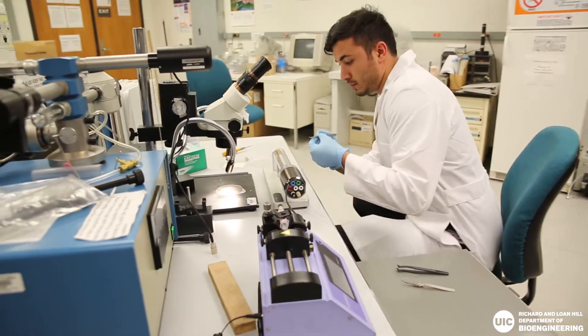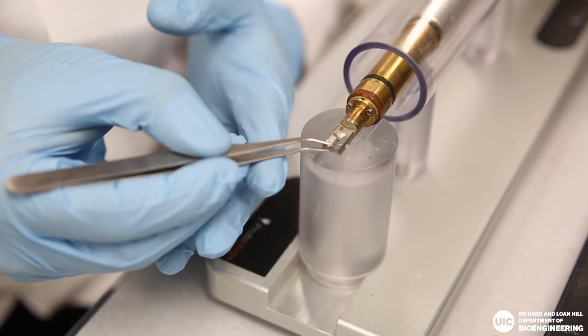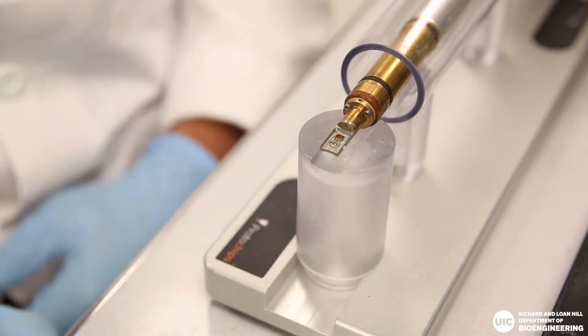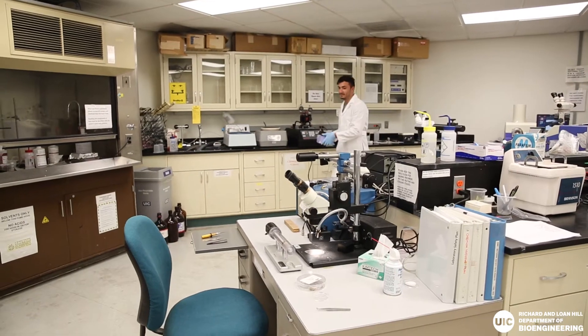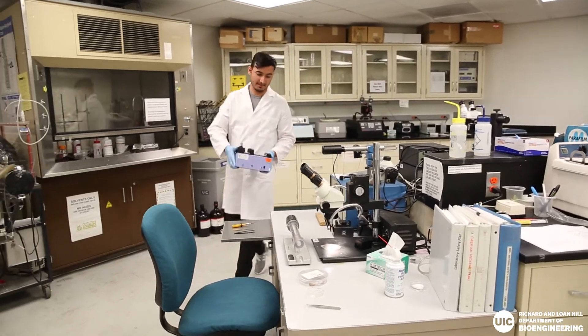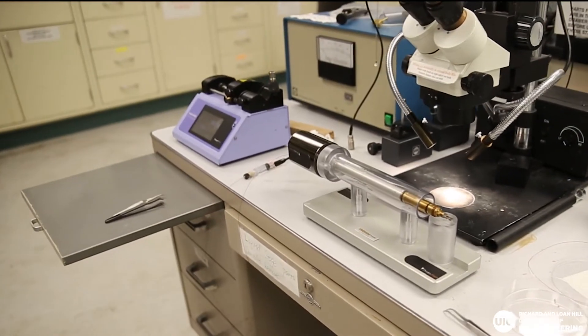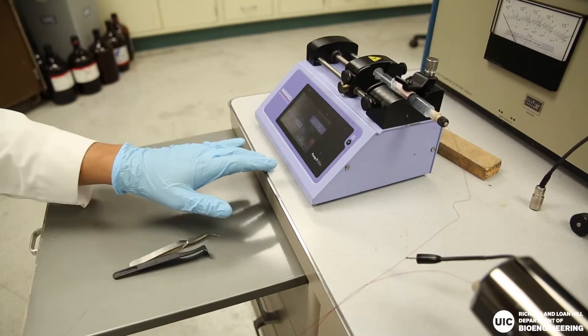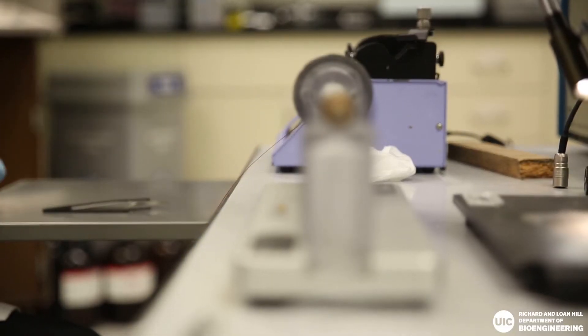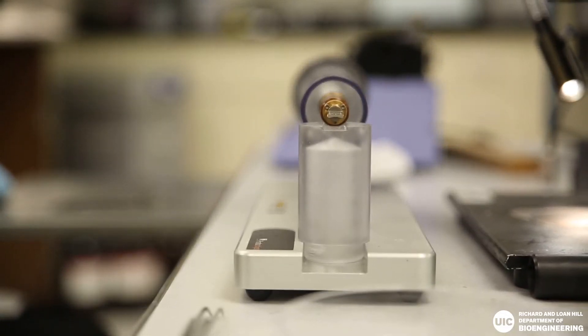Here at UIC, we are equipped with state-of-the-art liquid holders compatible with our top-of-the-line transmission electron microscope. Using electron microscopy techniques, we look at the interface of polymer nanoparticles in pressures ranging from 10 to 1000 atmospheres to resolve the molecular structure of adsorbed solvent on solid interfaces.